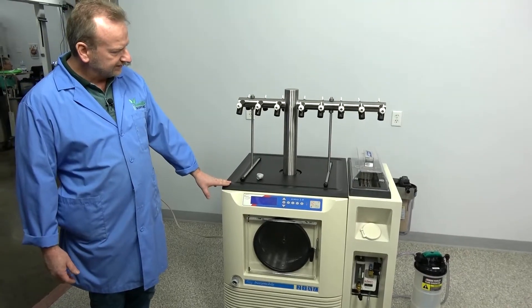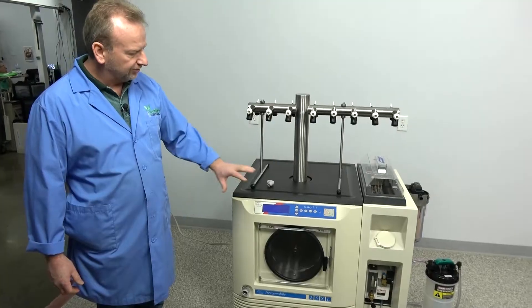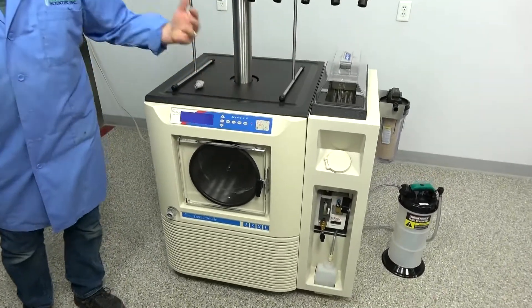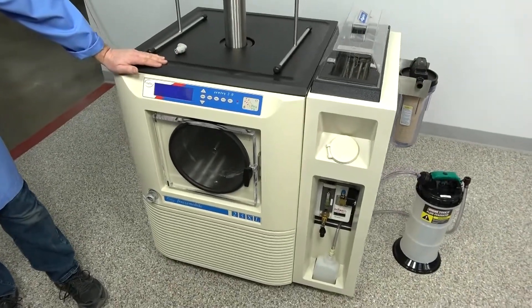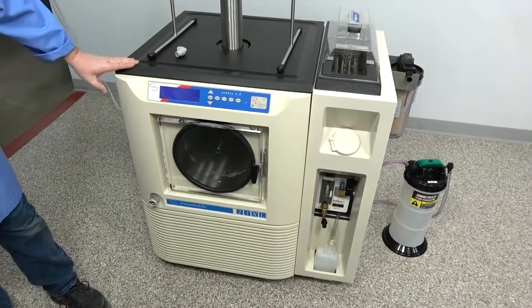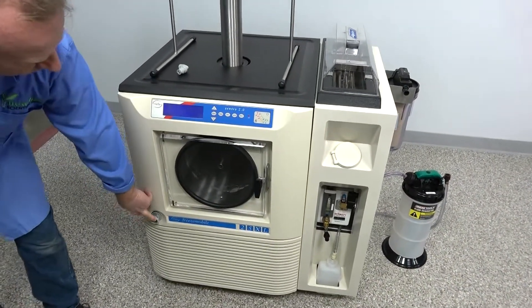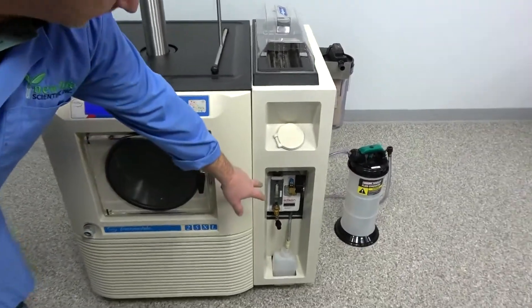I've just gone through this — gone through the refrigeration, put all new door seals, all the vacuum hose, anything that would have a possible problem down the road as far as leaks in the vacuum. I've replaced about everything, including the valve here — put a new valve in, and put the rebuilt Addixson vacuum pump in there.